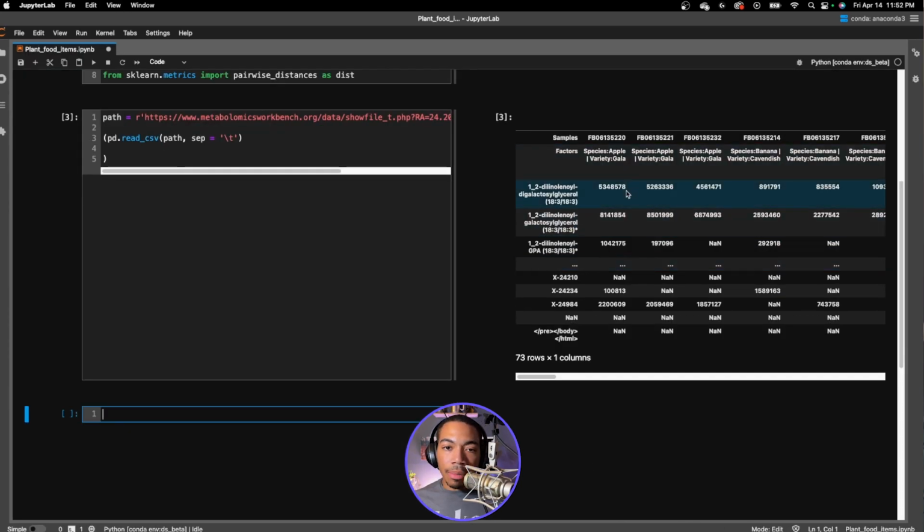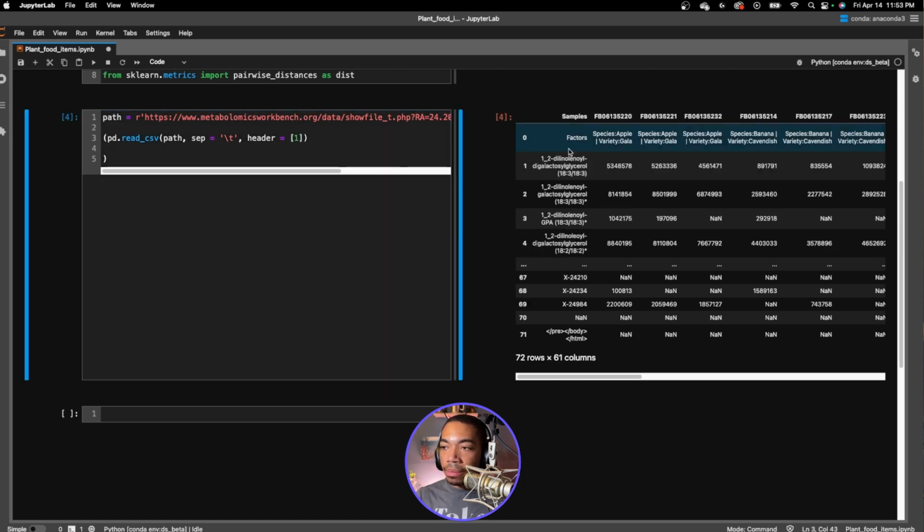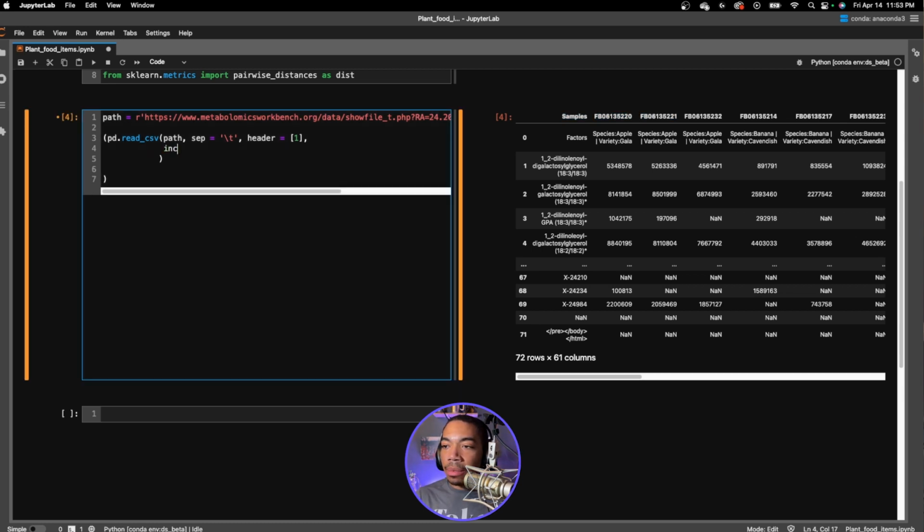So pretty quickly we get to something that already resembles more of a table, which is a great step. And so let's now begin sorting out this header situation. Technically, based on the structure of this data table, there is no header identified by the read_csv. So let's specify a header. We'll do that by passing in the header argument, the index where the header is located as a list. In this case, the header we want will be 1. When we run that, you see that now we have a header row. Next, let's set the index column. So we do that by passing index_col, and we'll set that equal to 0.